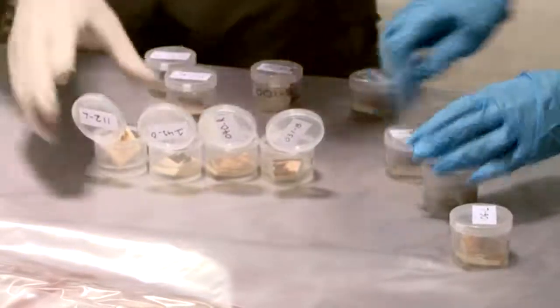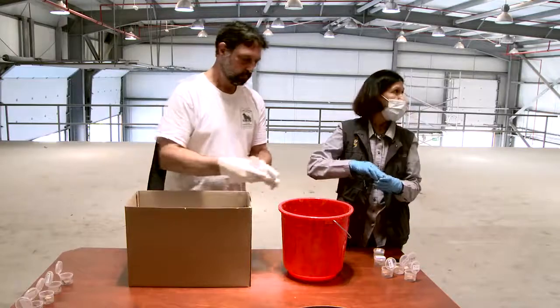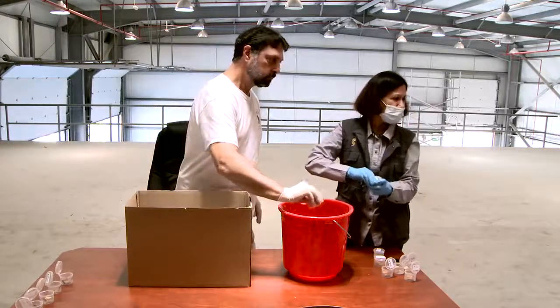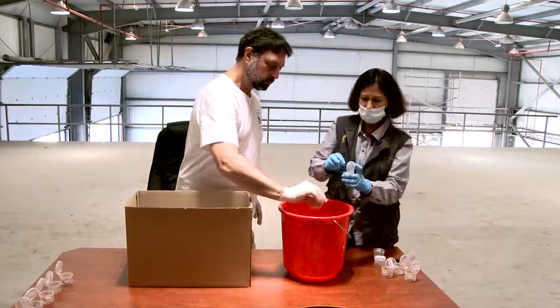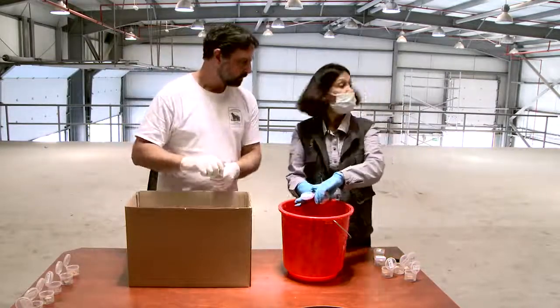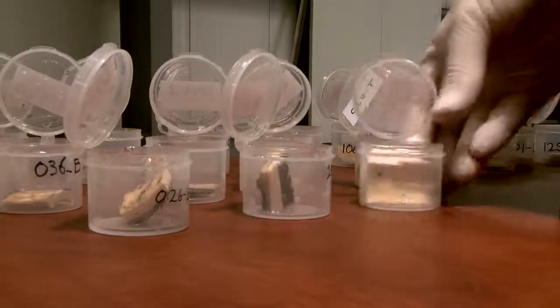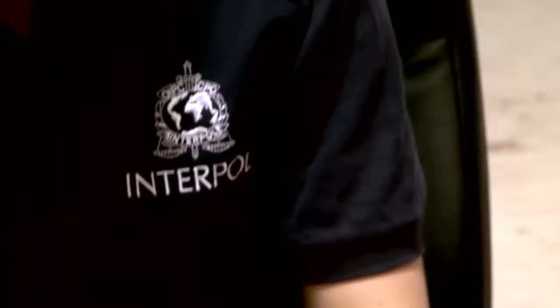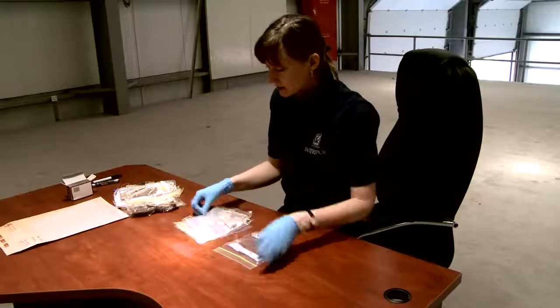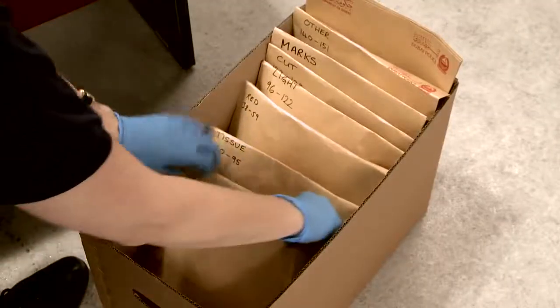Shake the container for at least 10 seconds to thoroughly coat the sample with the liquid. Let the solution sit for 2 hours and then pour off the liquid. This can be poured down the drain if followed with lots of running water. Do not greatly exceed the 2 hours, as this could have a negative effect on the laboratory analysis. Close the container lid tightly again. Documentation on letterhead attesting to this decontamination treatment must be sent to the laboratory with the samples.